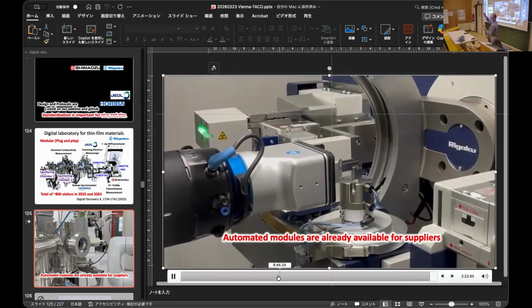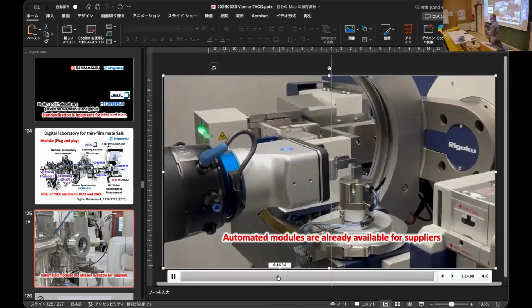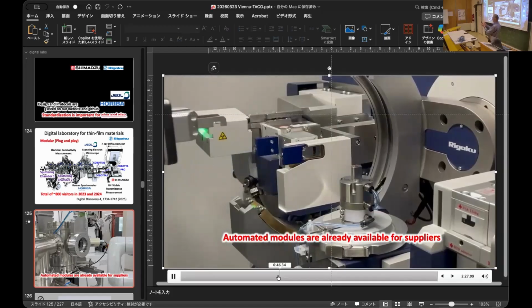Overnight, the robots synthesize the materials, and then in the morning, all the samples are ready. So they do the measurement that only humans have to do. And then when he or she goes back, they put the sample holder into the system, and then overnight, the system makes a sample. So the workflow of a student is changing.